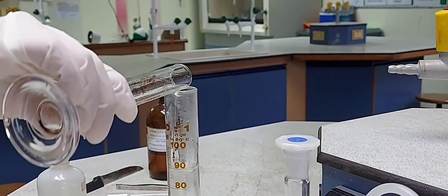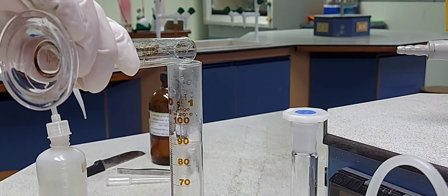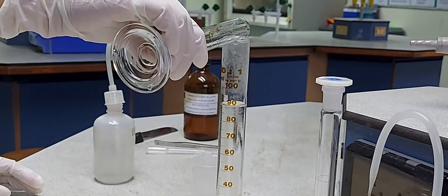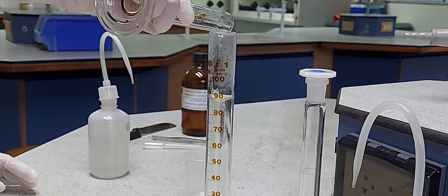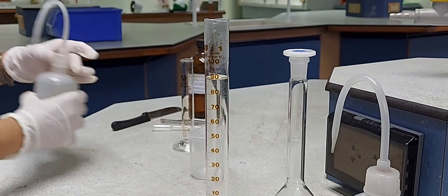So after adding the acid to about 70 ml water in the measuring cylinder, I will be transferring this acid into the graduated flask which is 250 ml capacity.